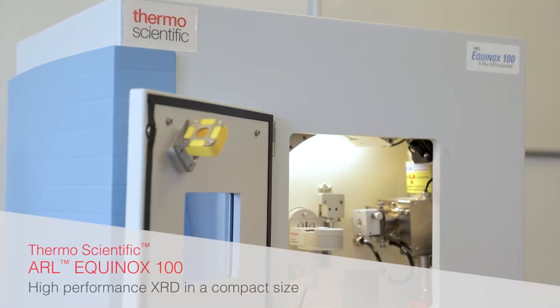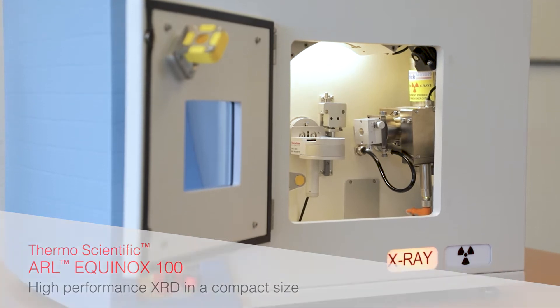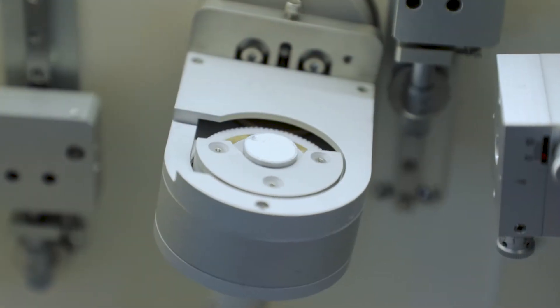The Thermoscientific ARL Equinox 100 X-ray diffractometer is designed to meet structural and phase analysis requirements in both industrial and research laboratories.